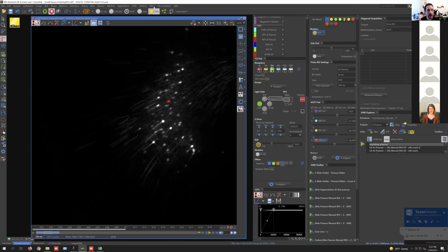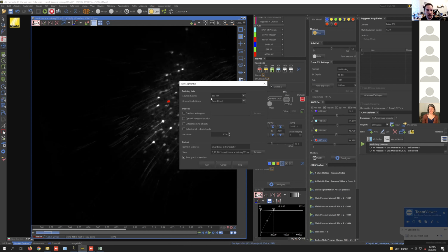So that's it here, and then we can go into train segment AI. One nice thing I should mention: training these networks, you probably spend about an hour to an hour and a half doing the masks. Training the network takes about 8 hours overnight on one of these systems. Let us know if you're trying to do that, and we can work something out, because we don't want to charge you the full rate of the instrument if you're just training a network. So let us know if you're doing something like this.